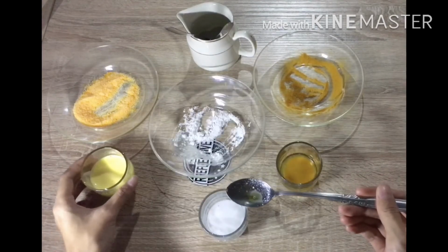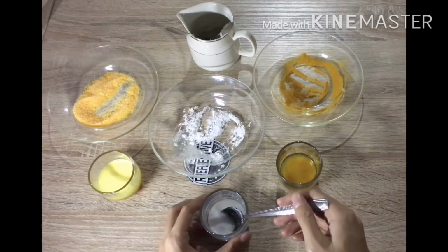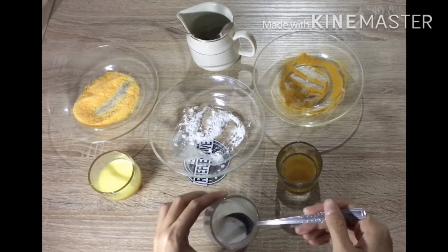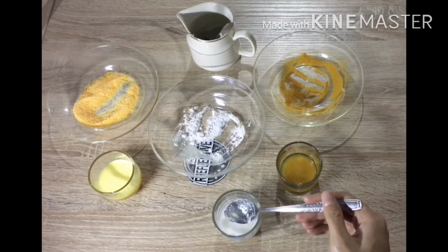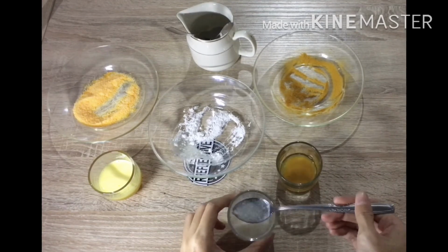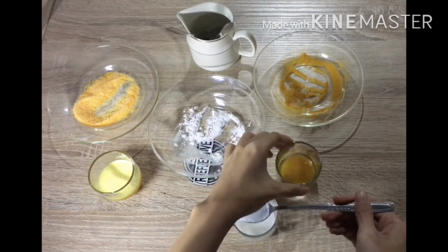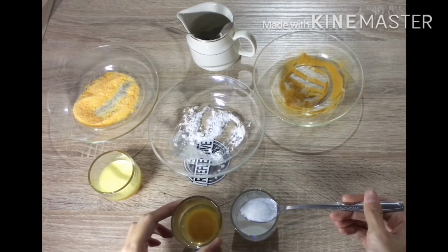Alright, we will move to the second. I will combine a base solution with the turmeric solution. Let's watch to see what happened.